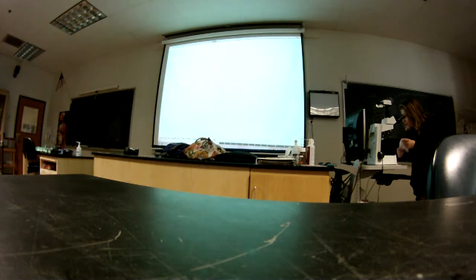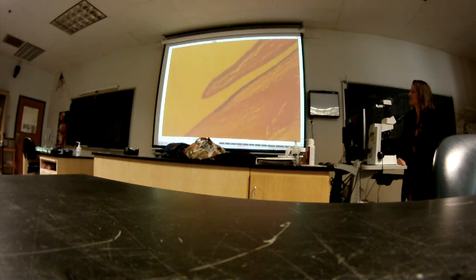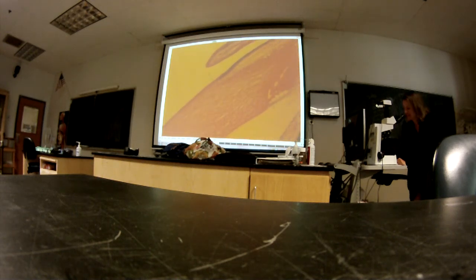Are we supposed to know the difference between the ocular and the palpebral? Oh, the palpebral. Yeah, I did write that on the board. Yeah, there it is on the list. That little hair or something on there. There it is. Okay. That's pretty weird, huh? The eyelid. No eyelashes, though.